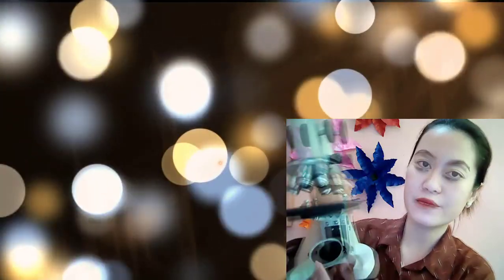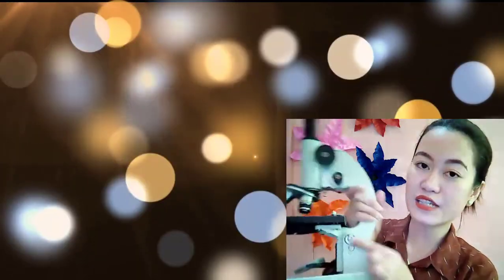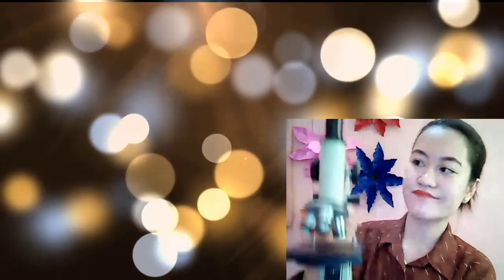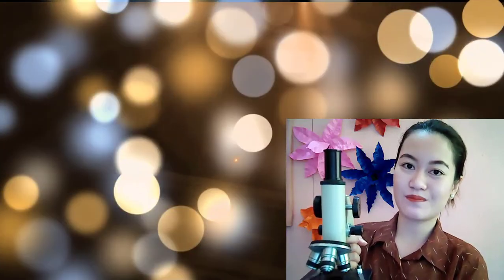Okay. And then we have here the diaphragm. We have here the mirror where the light comes from. And this is the inclination joint. And this is the base. Okay, class? So those are the parts of the microscope.